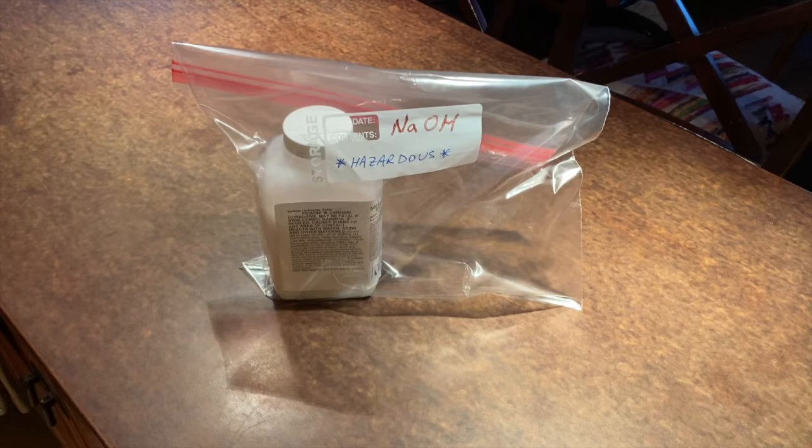I've also decided that when I'm done with any experiments, I'm not going to retain any solutions with alkaline hydroxide in them if I'm not personally there. This way I don't have to worry. The only form in which this stuff is going to be stored is dry in its original container, where it is the least hazardous and most well contained and labeled.